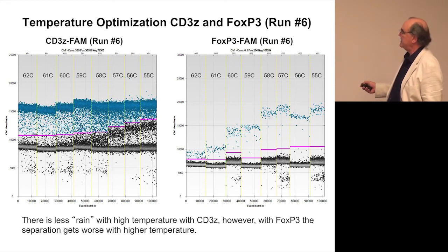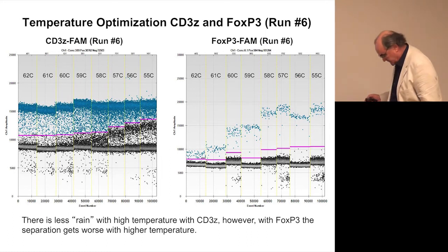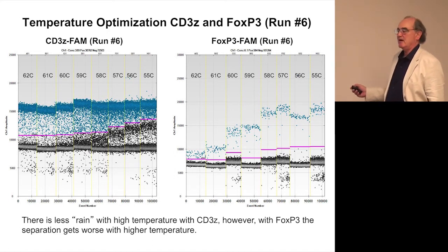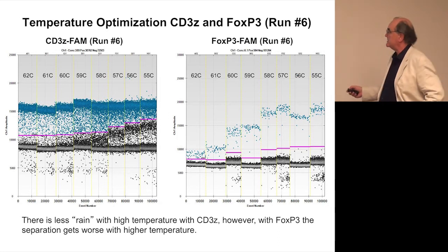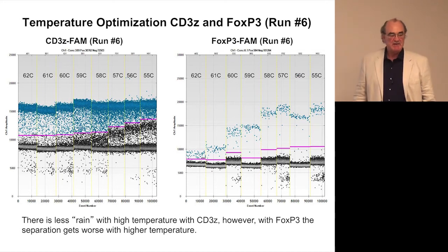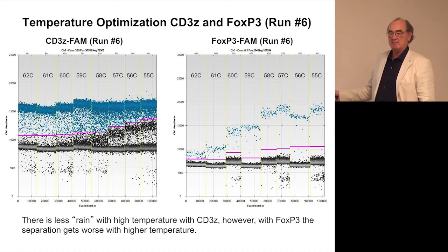And here's another gene, FOXP3, which you can see. Somehow this got on the same slide. I didn't mean it to be on the same slide, but here's another promoter that detects a subset of T cells called T regulatory cells. And here you can see that changing the temperature doesn't really influence this, I don't know what it is. I'd be glad if you guys could tell me what this is. We can threshold this and get very nice numbers, but here we don't have that problem.